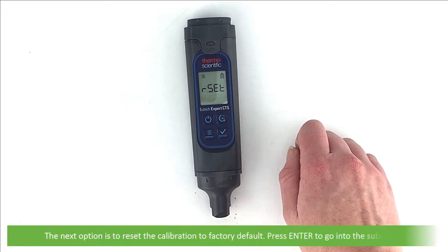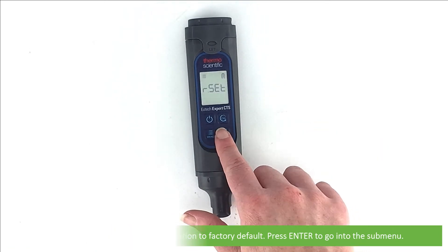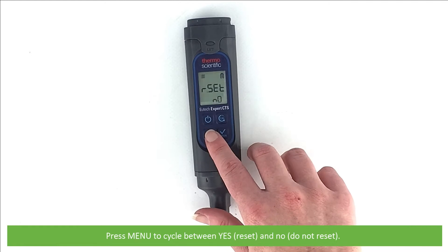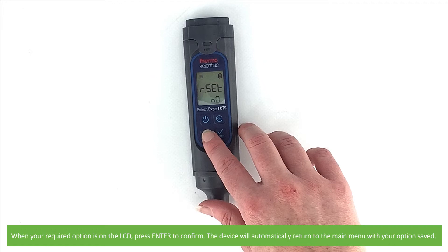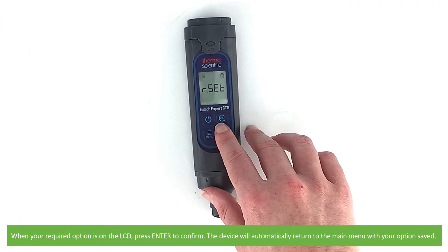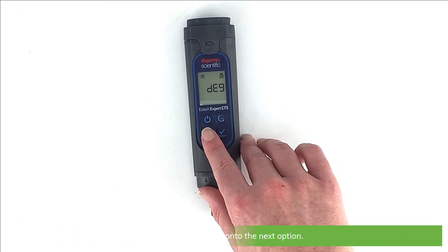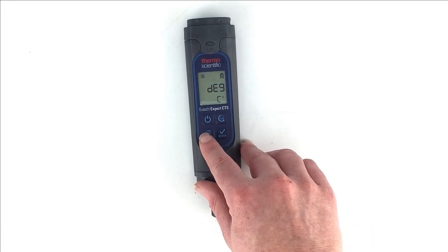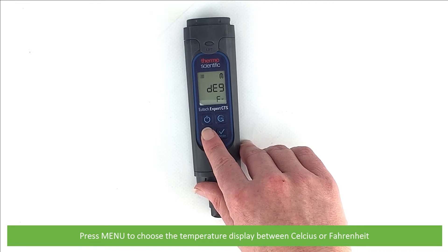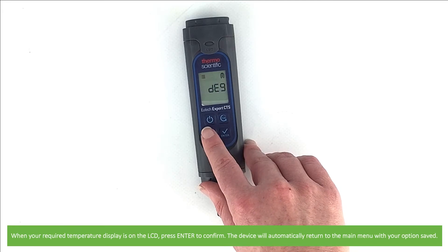Press Menu to move on to the next option: reset the calibration to factory default. Press Enter to go into this submenu. Press Menu to cycle between Yes (reset) and No (do not reset). When your required option is on the LCD press Enter to confirm. The next option is temperature display. Press Enter to view the submenu and press Menu to choose between Celsius or Fahrenheit. When your required temperature display is on the LCD press Enter to confirm. The device will automatically return to the main menu with your option saved.